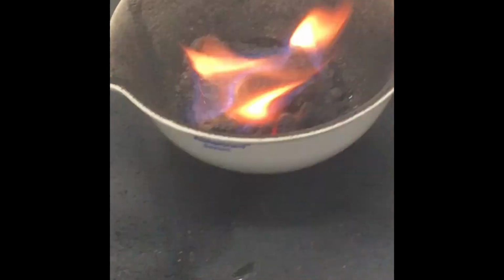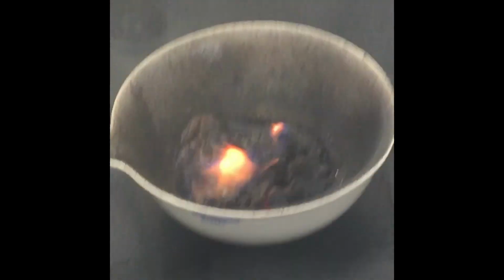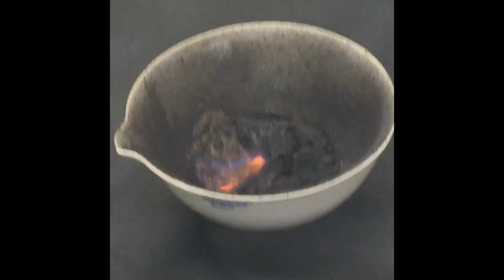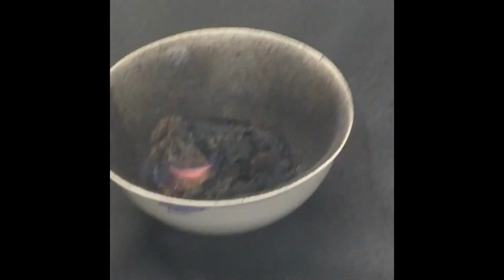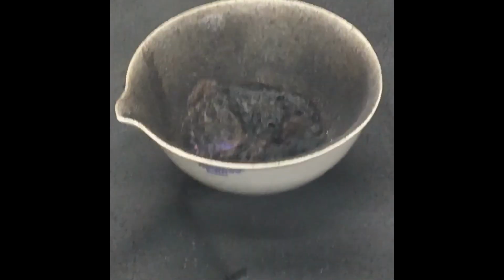Now it looks kind of like a flame from a burner. This is amazing. And again, we created fire. Isn't that awesome? Chemistry is awesome, guys, as long as we do it safely. Of course, I'm in the hood.